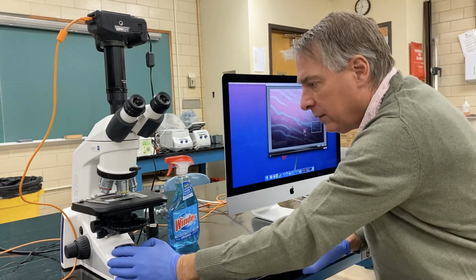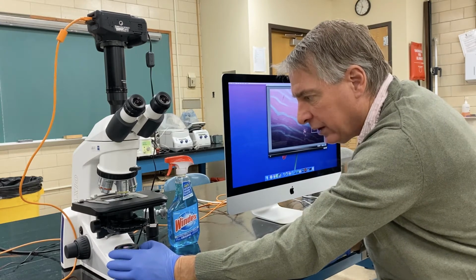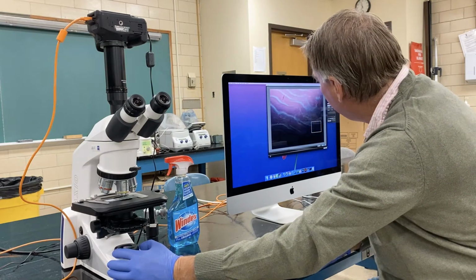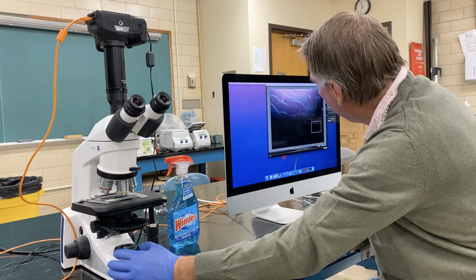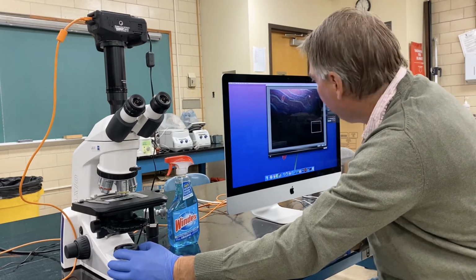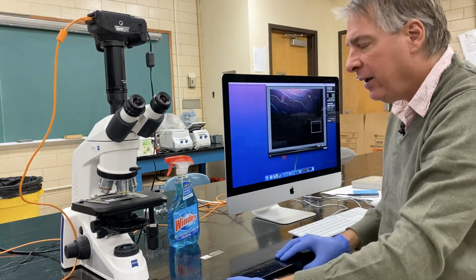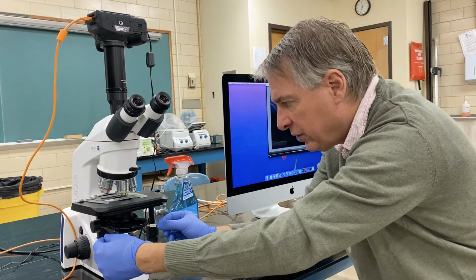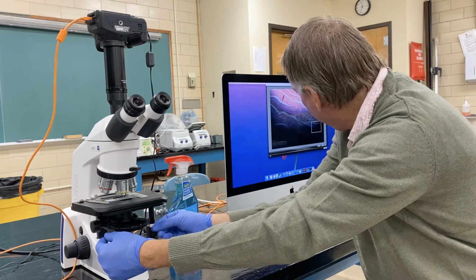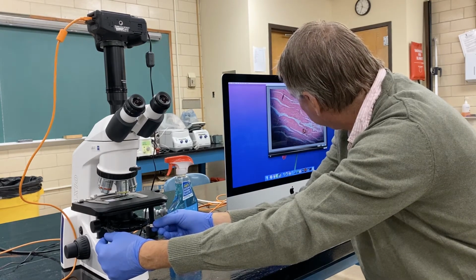Then I'm going to decrease the aperture of the field diaphragm, which is down here just above the light bulb, and I'm going to turn it counterclockwise to make the aperture of the field diaphragm smaller. So now you can see it's towards the top edge of the live view window. Now I'm going to try to center the condenser lens using these 2 adjustment knobs. So I'm first going to try the right knob, and that starts to center it a little bit.